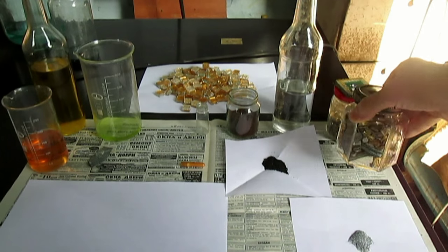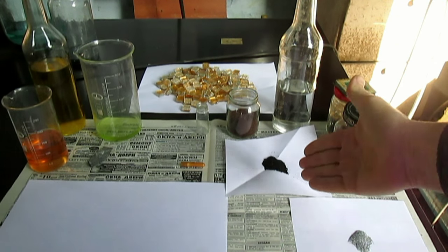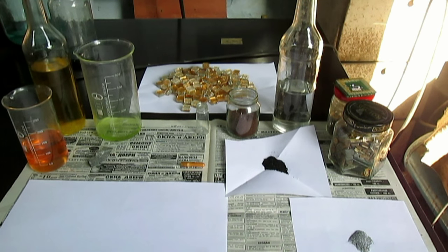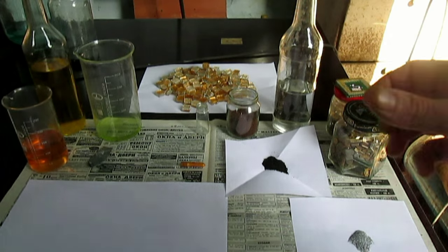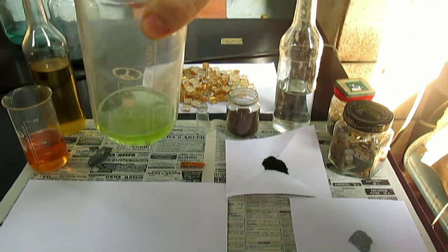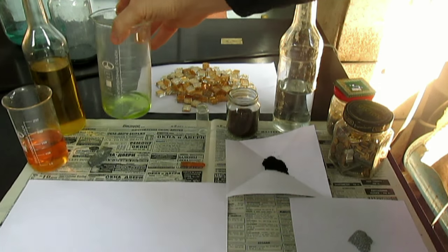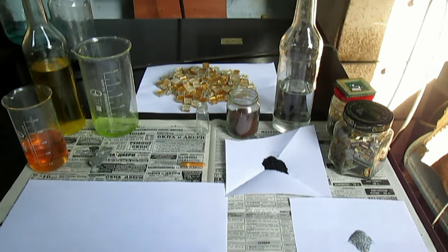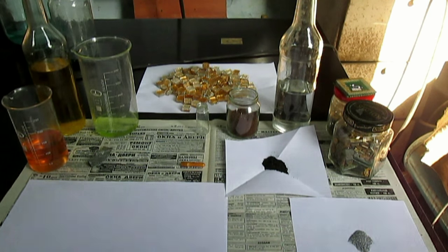На столе находятся радиодетали, всякие восстановители, новые восстановители, о которых я ещё не показывал. Растворы с золотом — к примеру, раствор с золотом, который я получил из посуды. Это видео вы сможете посмотреть следующее, оно будет называться «Как получить золото из посуды». Также на столе находятся вот такие кубики.